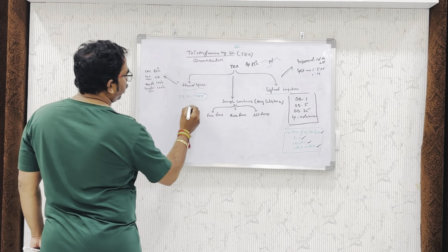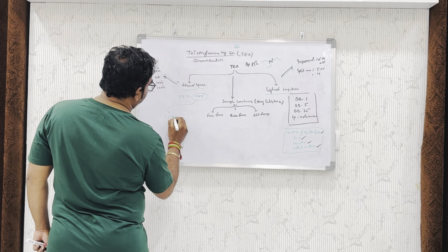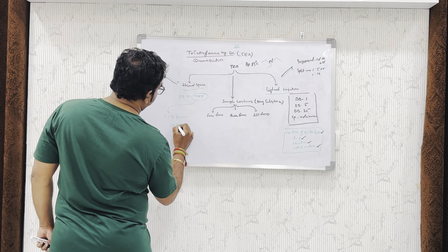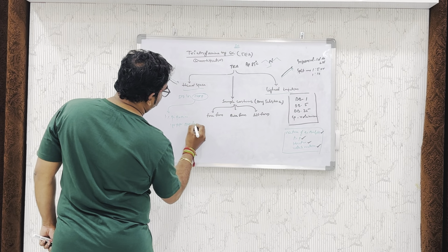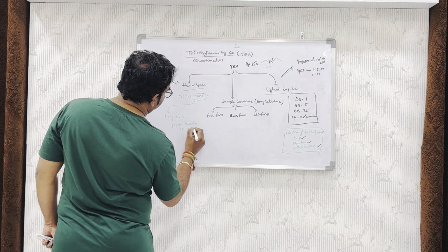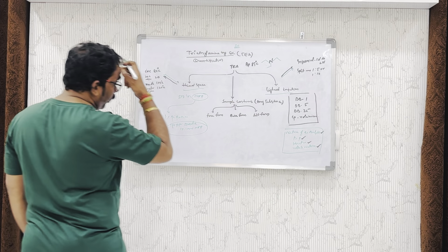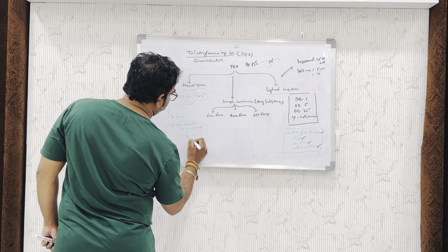The NMP contains 1% piperazine, meaning 1 gram of piperazine dissolved in 100 ml of NMP.